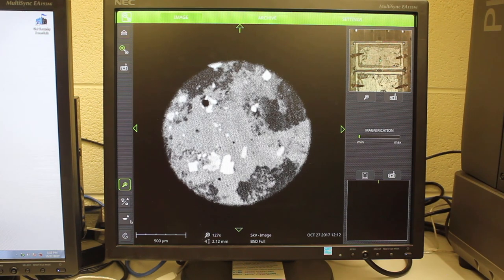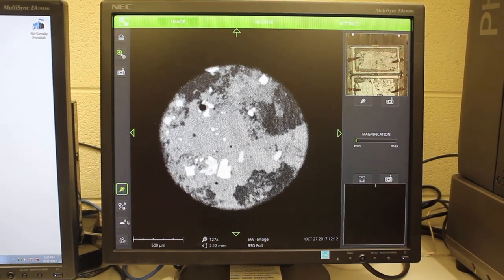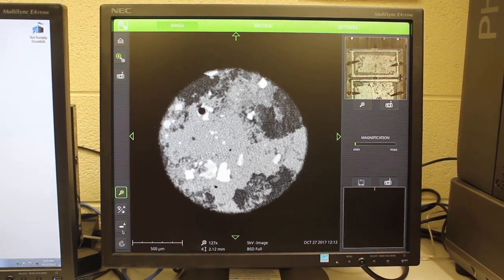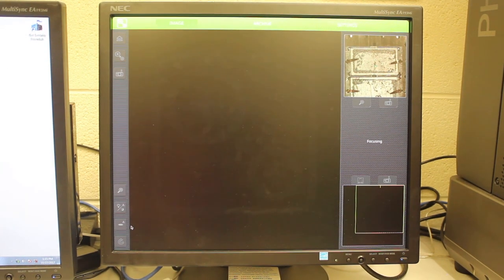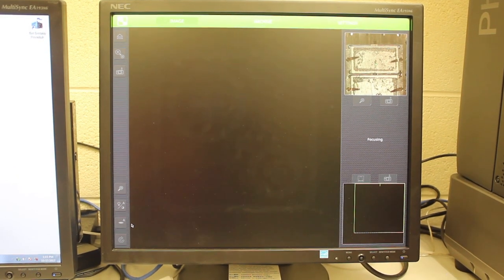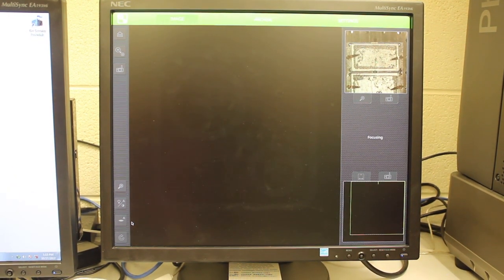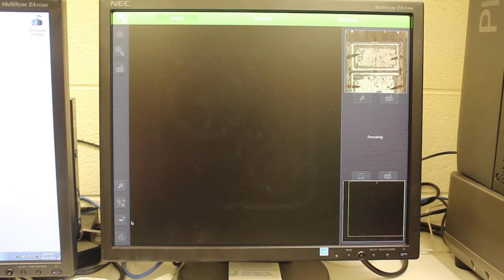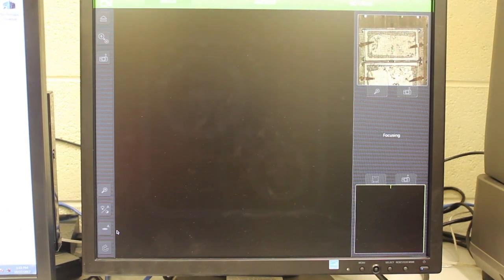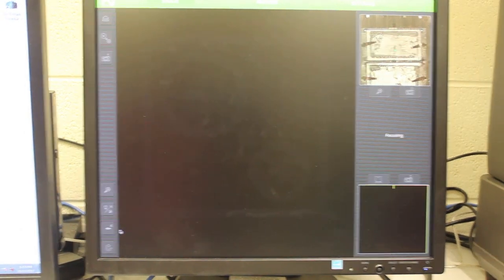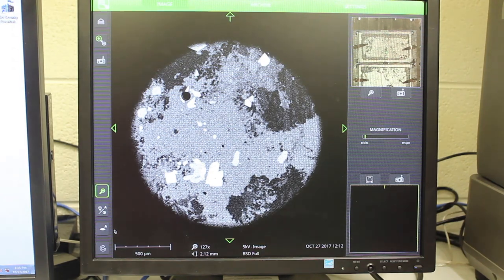We still want to improve the image using the other two buttons above and below that button. The one below it with the oval is the focus, and right now it has an A on it because it's autofocus. You can also change it to manual focus by holding down the left button on the mouse.